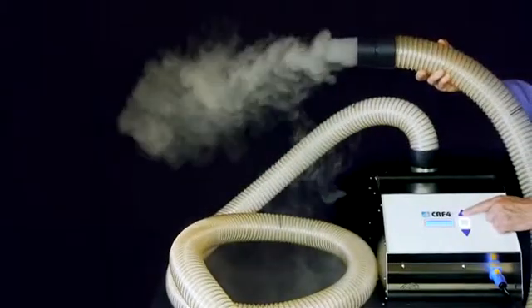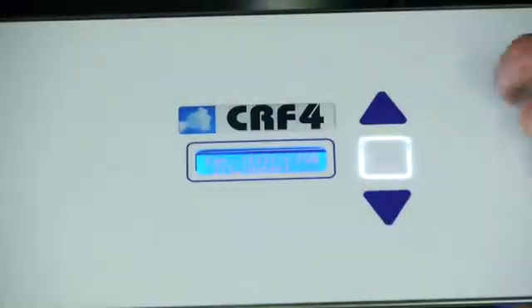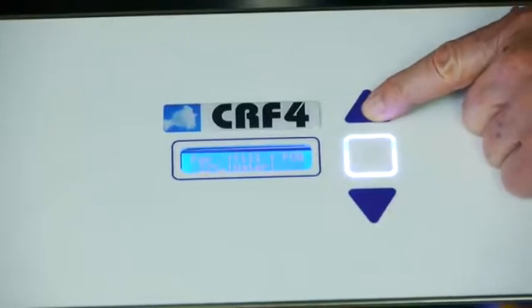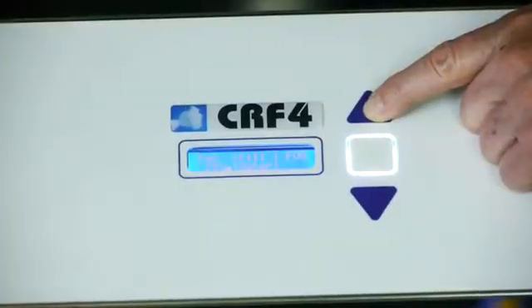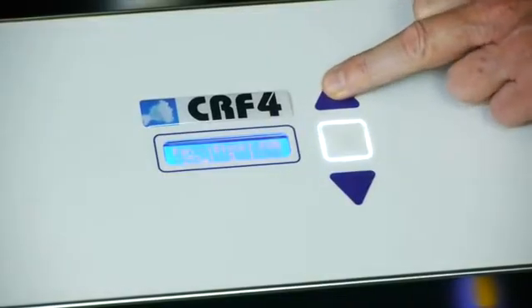Use direct touchpad control to match the CRF4 fog velocity to your airflow. Go to 20% velocity and trickle 25% fog volume into your clean area, or increase to 35% velocity and 100% fog volume.